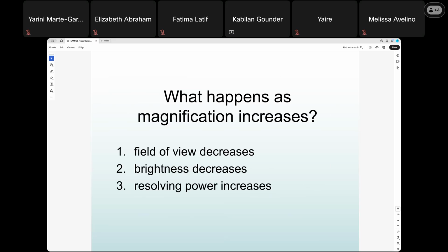So always when you go to higher magnification, the resolution should also be maintained. Otherwise, you cannot see the image in detail. So always make sure when you take a picture that you maintain the magnification until you see a clear image. Beyond that there is no use, because the image quality will decrease. So make sure you know what happens when you increase the magnification, and what happens when you decrease the magnification.